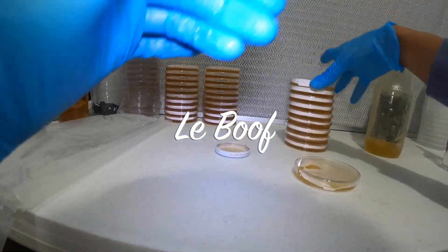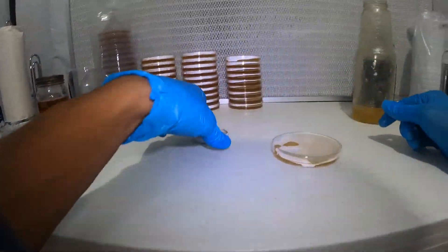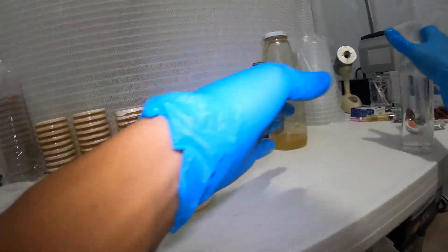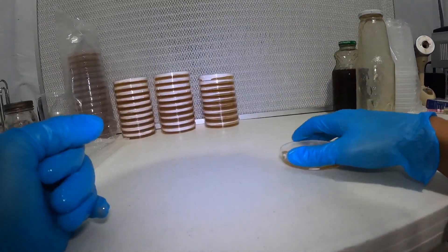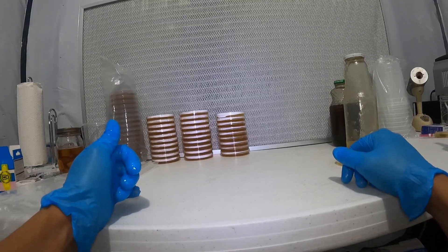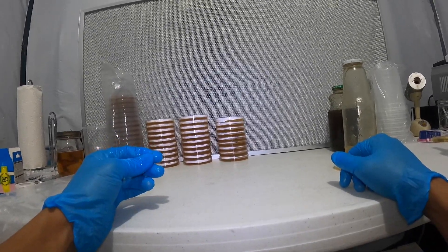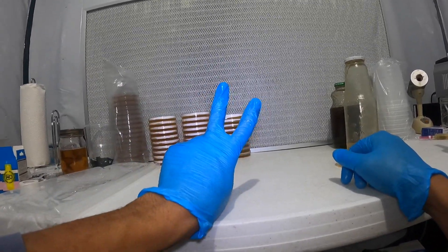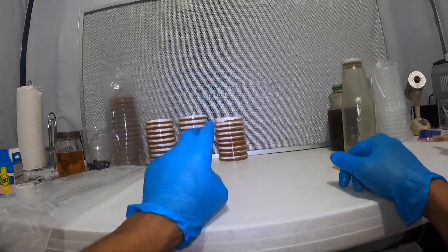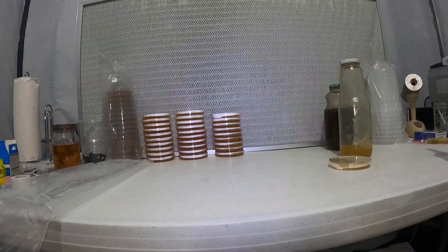Alright, we've got our agar dishes here. I'm going to let them cool down and then we're going to get rocking with some projects. I hope this video was helpful for you guys and I hope you can start to propagate. Much love, peace — let's grow.